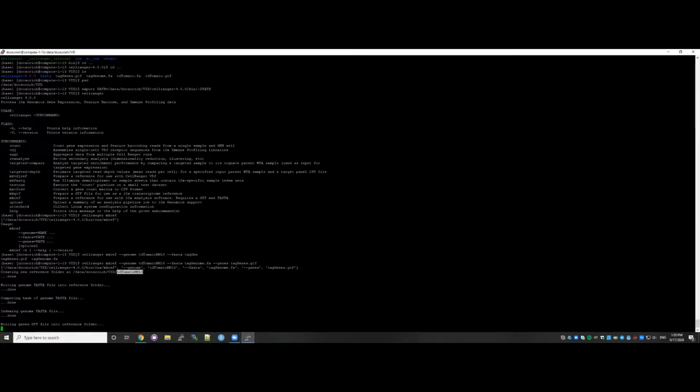And this reference is the one that we are going to use to quantify the genes in each one of the cells.